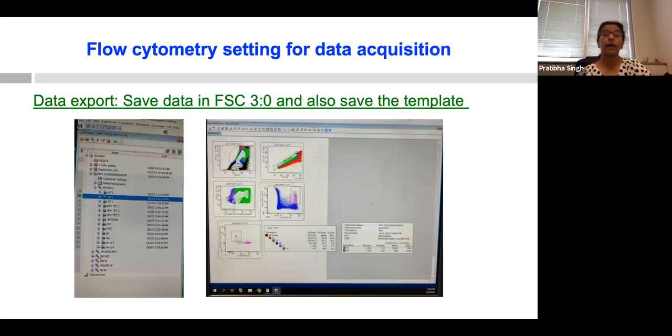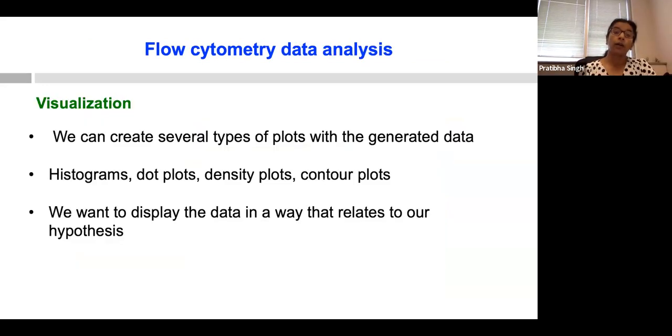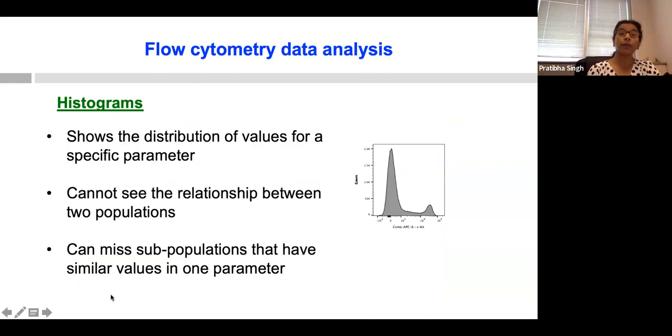I can give you an example from here. When we plotted this way, we wanted to know how many LSK or SLAM LSK cells are present in the mouse bone marrow sample, and how NPY overexpression impacts their number. So we plotted this way to see that information. Depending on what kind of information you want to get, you have to use different plots. Sometimes people use histograms, and sometimes dot plots or contour plots.